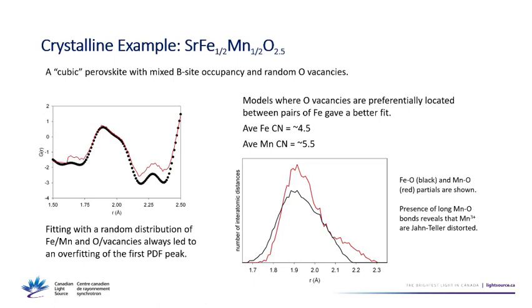And can we do it with the data that we collect from an X-ray source? Maybe. I mean, you could. It would be less sensitive, right? Not with iron and manganese, you couldn't, because they're right next to each other on the periodic table, so they're going to scatter very similarly. But if you had two atoms that were quite different in the number of electrons they had, you could.